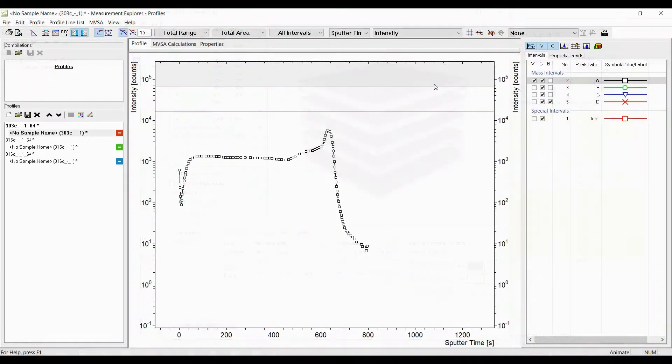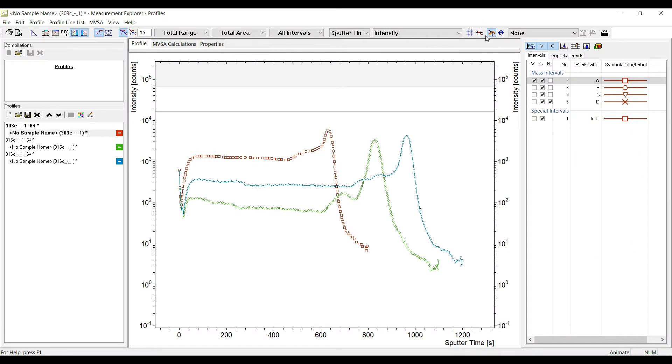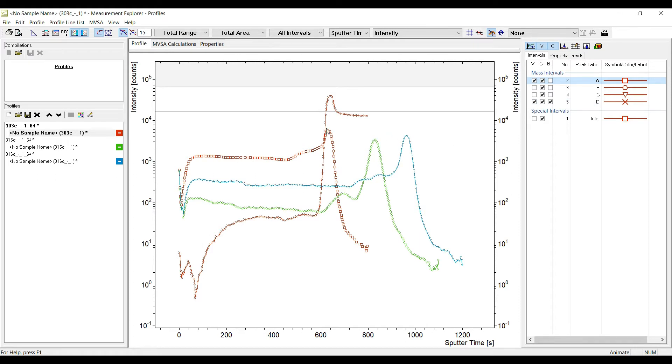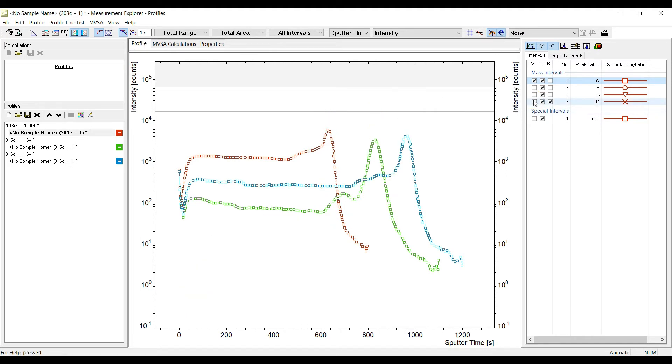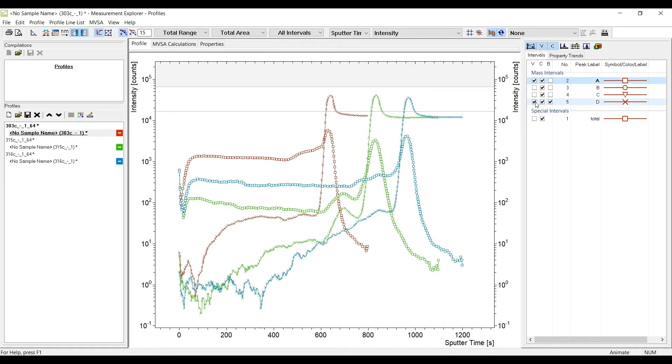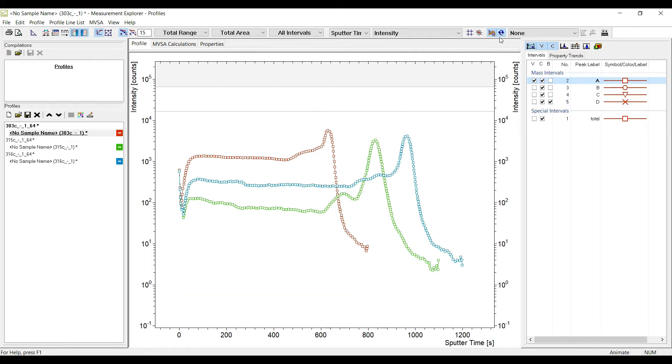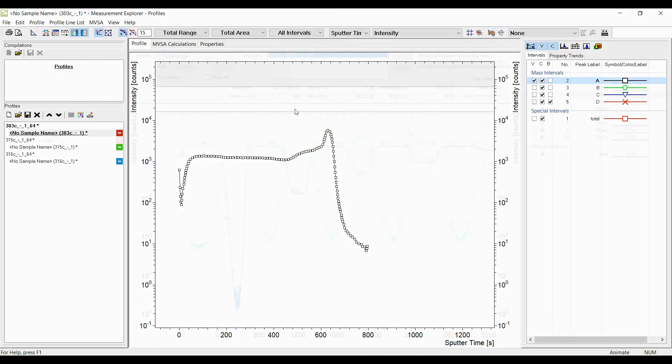If you have an overlay you may want to switch the visibility of the profile lines for all data sets in the overlay at once. In order to do so use this button to synchronize all line properties in the overlay. This synchronizes not only the visibility but also the color and symbol of the profile lines. This is a quick way to apply the same line properties for several data sets.